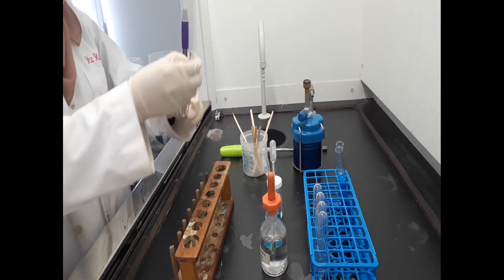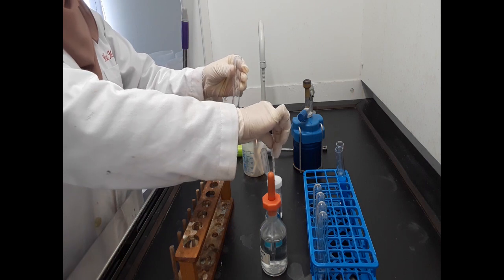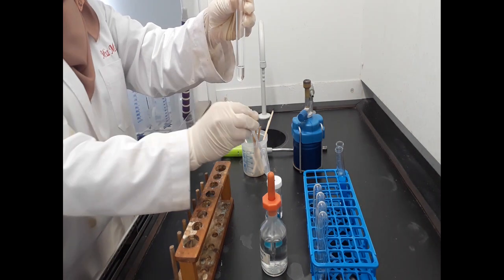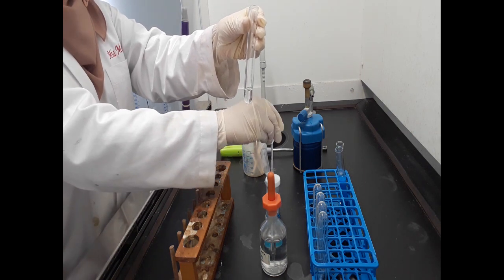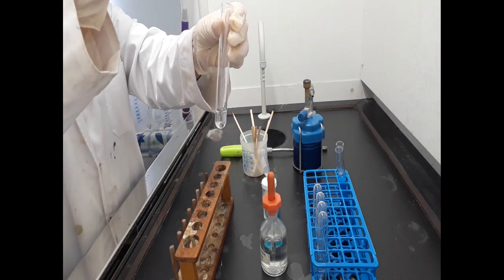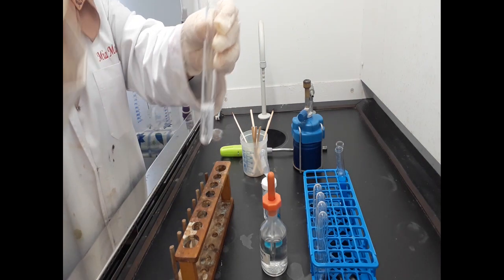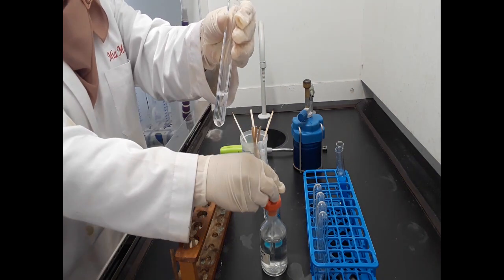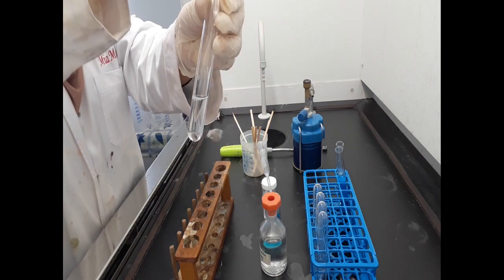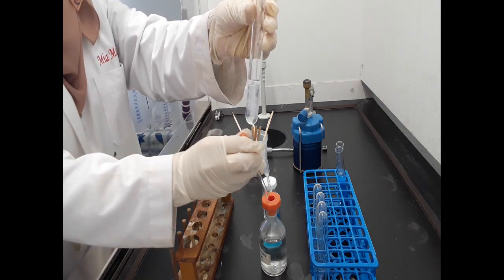Now, this leads to question 2a. To 2 cm depth of a solution in a test tube, add aqueous ammonia until a change is seen. As usual, we start with solution R, 2 cm depth of solution R, and add aqueous ammonia until a change is seen.